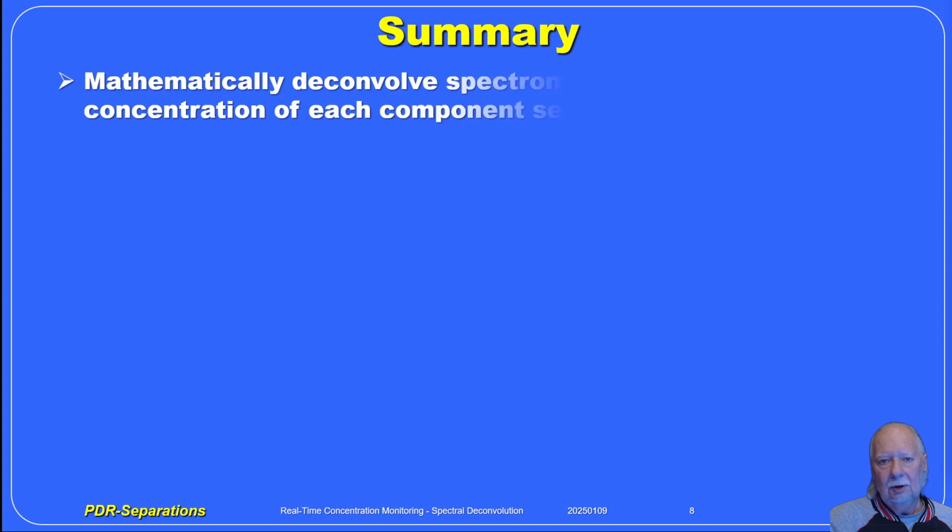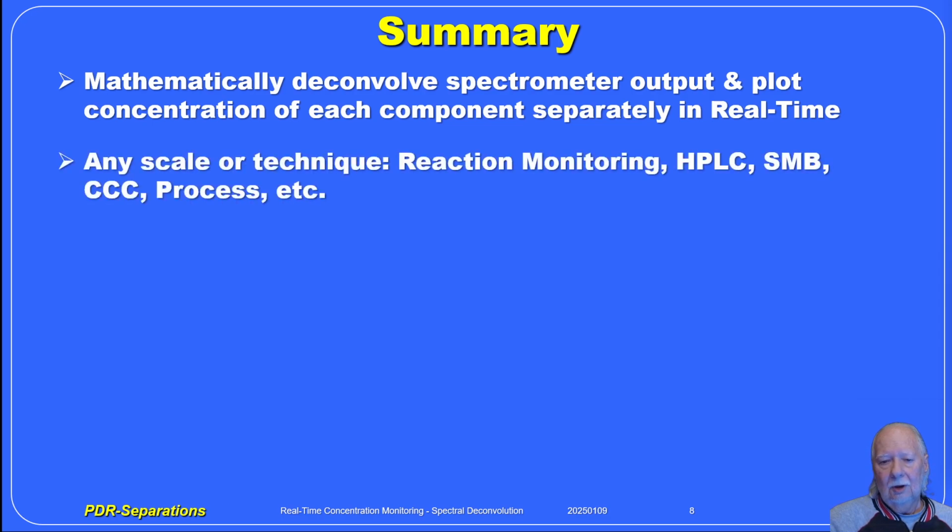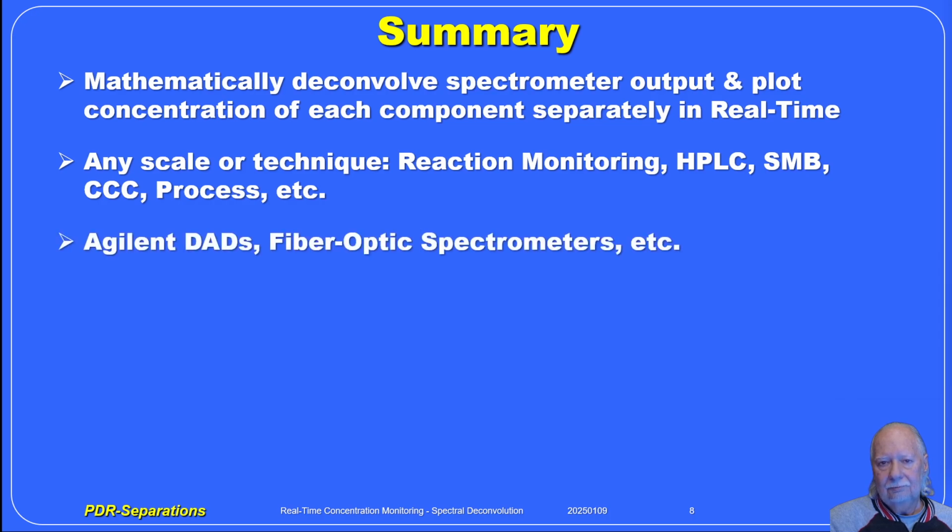In summary, we mathematically deconvolve spectrometer output and plot concentration of each component separately in real time. We can apply this at any scale, any technique: reaction monitoring, HPLC, SMB, CCC, process, etc. We can configure this with Agilent DADs, fiber optic spectrometers, etc.